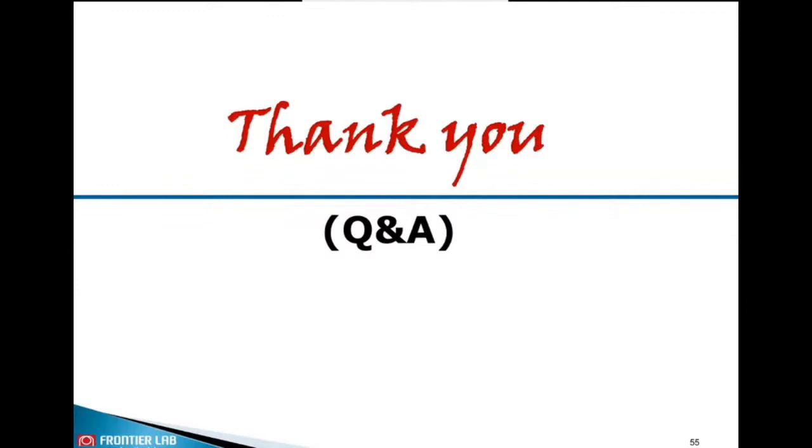Which assignment fragment confirms? I think it's the same question again. Conduct a webinar on F-Search for polymer interpretation. Okay, we will do that. And EGA software means PY control software. Okay, thank you for that. I'm not sure, so I will refer this question to our service side. Please contact your supplier, and you can also write to me. Then we'll get more information for you.